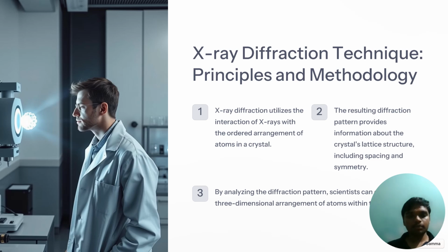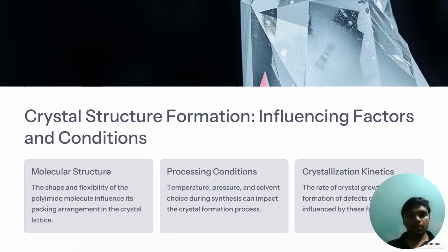Phase problem and electron density maps.